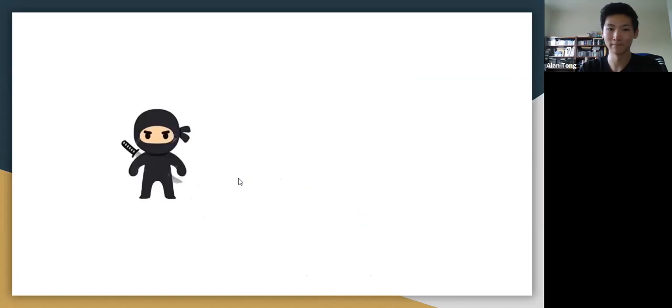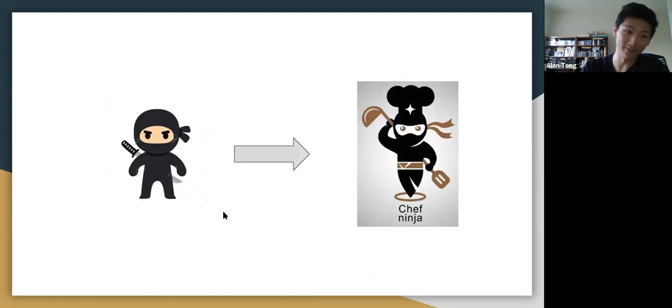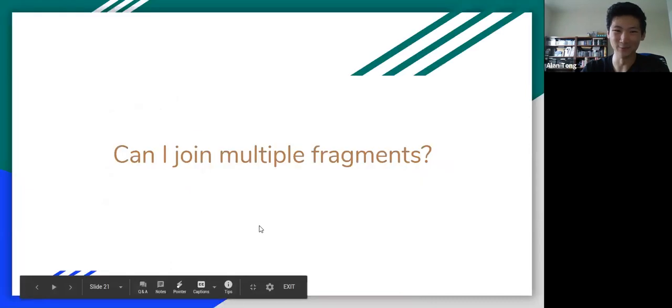Okay. So now, effectively, what have you done? We're not only becoming DNA ninjas, chopping the DNA, we're also making DNA. We're fusing DNA together with ligase. So in essence, you have upgraded from a DNA ninja to a chef ninja, right? You're not only cutting them apart, you're also making them together. You're making new things. So congratulations. All right, let's move on.